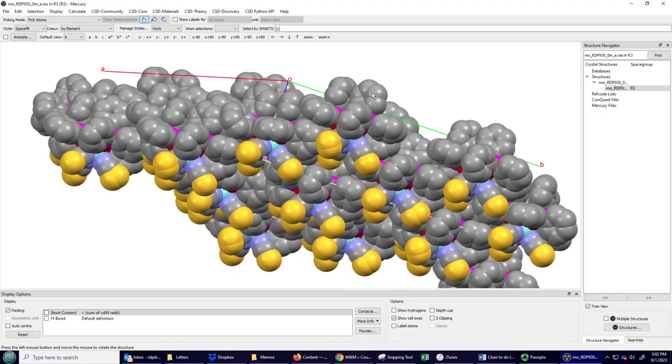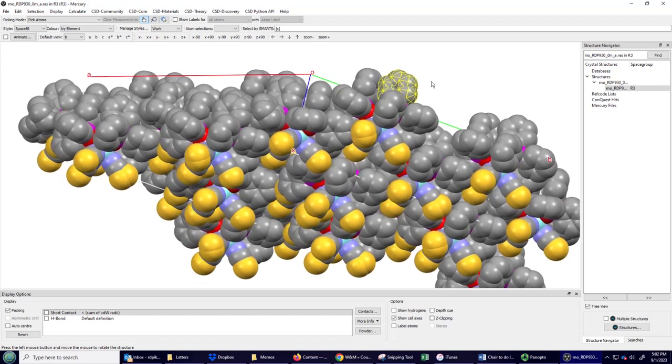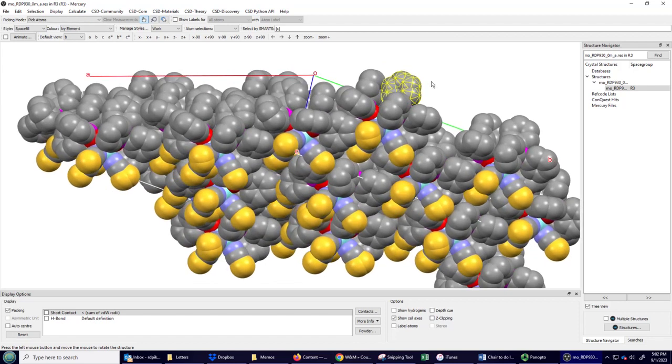Look at one of the phenyl rings, for instance, this one, where I'll pick out the 6 atoms. Hard to get this one. There it is. You see how it looks like a donut here, where each of the atoms is interpenetrated, interdigitated with the one next to it. That shows you something about chemical bonding, that when atoms covalently bond, as these carbons do, they actually share electrons, and so their electron clouds interpenetrate with one another.